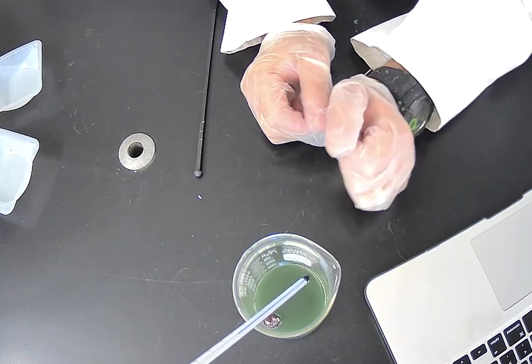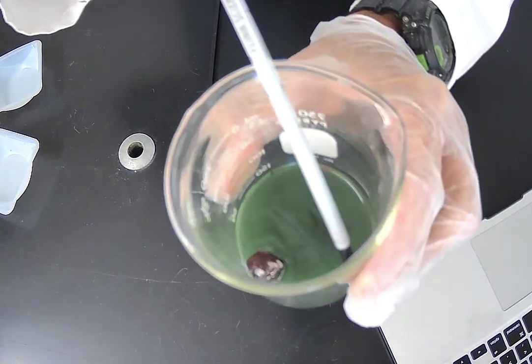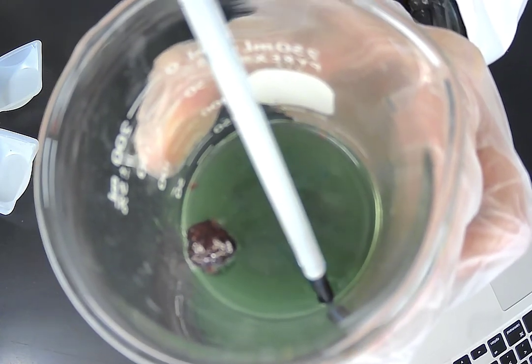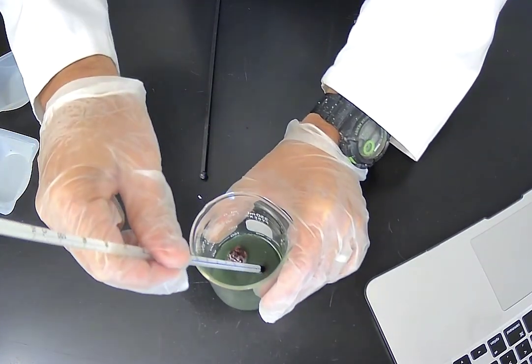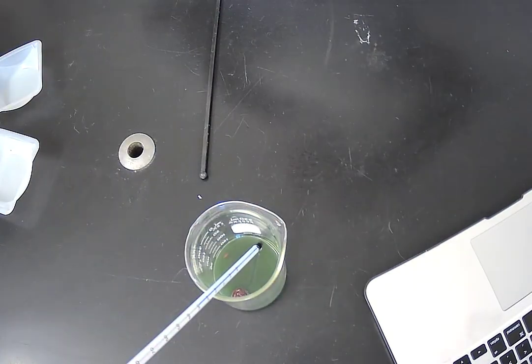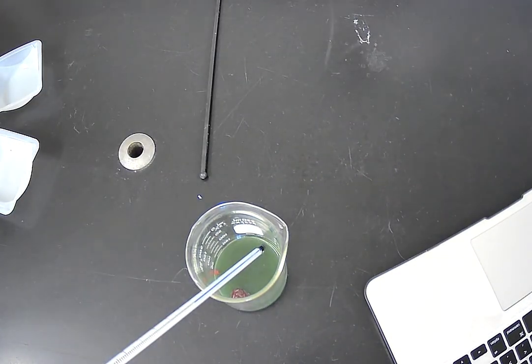Seeing a lot of bubbling going on. I'm going to try to get that into the camera view here. You can see some bubbling forming around the aluminum foil. We can see a dark reddish substance forming there as well. And at 3 minutes, my temperature now is 28 Celsius.